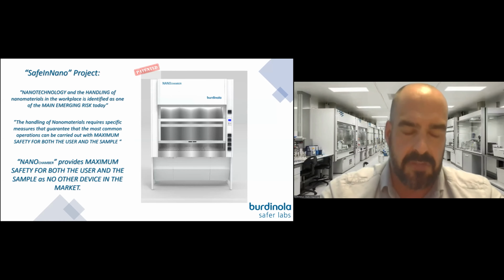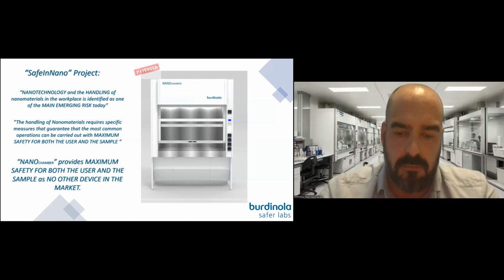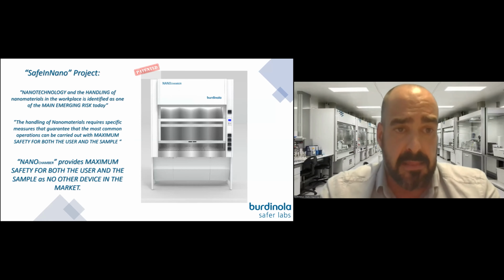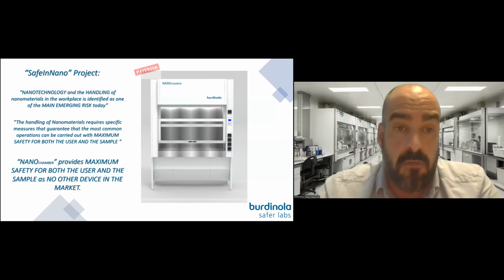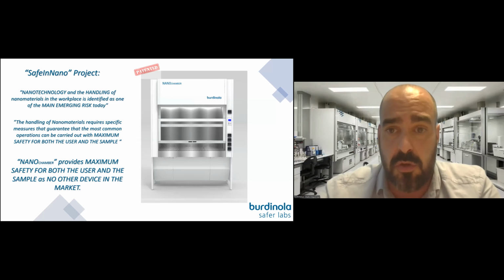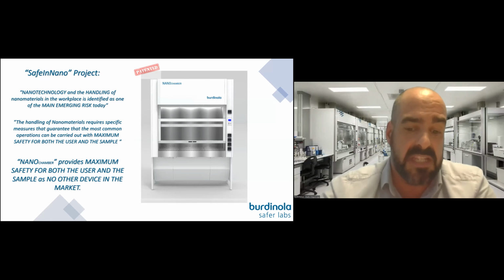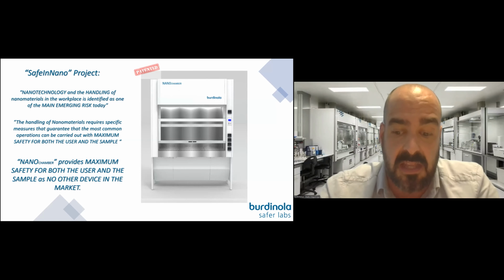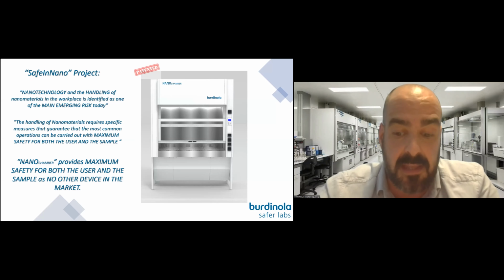So, as I have just said, I am Ekaitz, the Innovation Manager of Burdinola. And today I would like to present the process of development of the nanochamber, the device that you are seeing on the screen. This is critical equipment to keep researchers safe in the nanotechnology field, mainly in laboratories where raw material is handled in powder state and manually, okay?